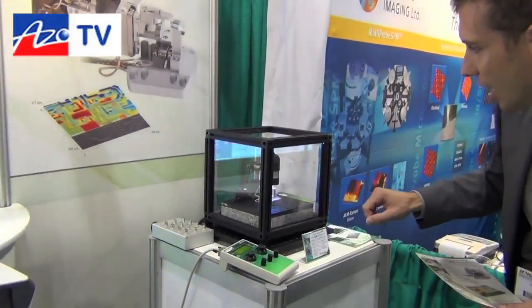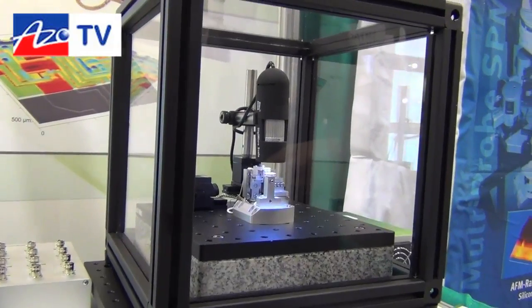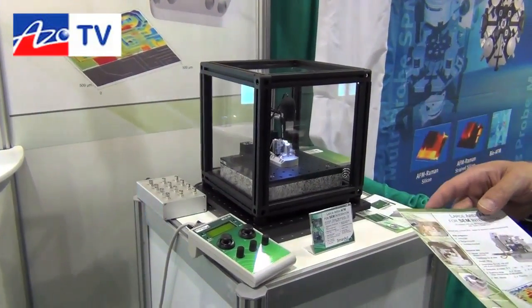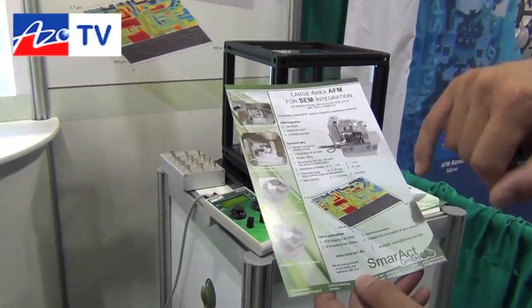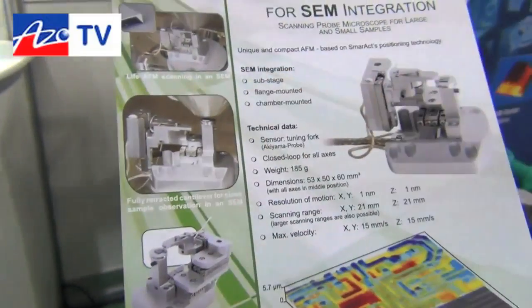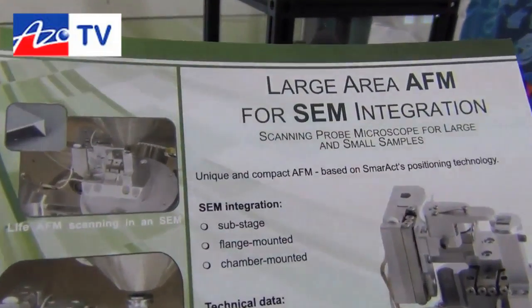Here you see the real thing. Right now it's scanning a small piece of scale. It has an Akiyama probe integrated, which is very well suited for SEM applications. The interesting thing about its design is it has a long range — we can scan over millimeters up to centimeters as necessary. We can also fully retract the cantilever, as you can see in that picture. Here it's fully retracted, meaning we're able to put the sample directly under the column of the SEM and get really good resolution SEM pictures. When we want to scan again, we simply move the probe back to the sample.